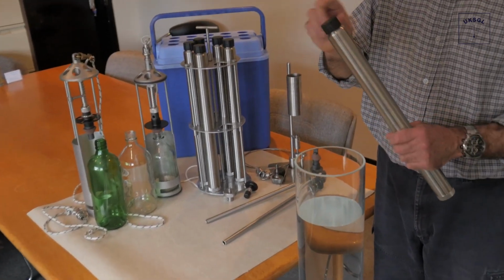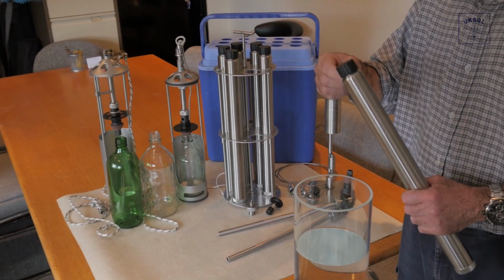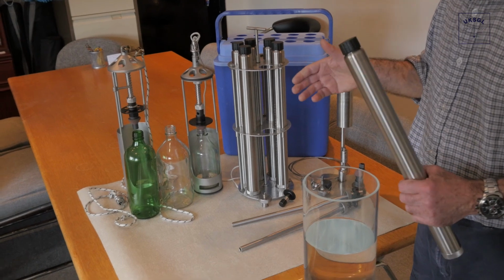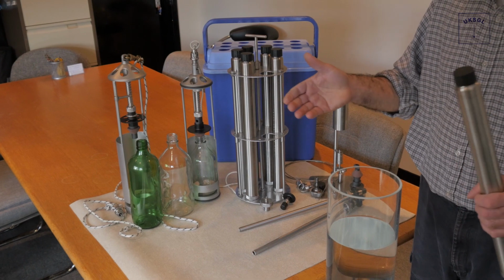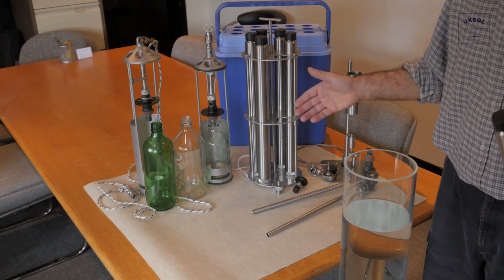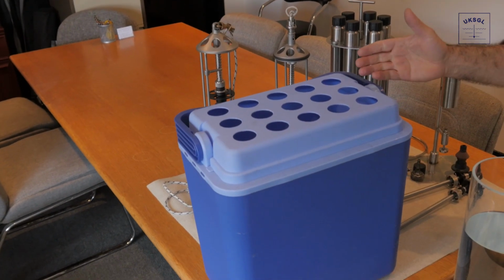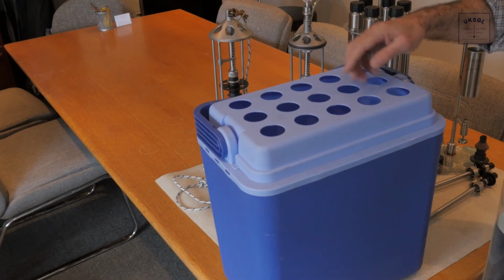It's good practice to mark each sample tube with a label to show which tank the sample is from. There should be 1 sample tube per tank, so you should ensure you hold enough tubes in stock. In addition, you may need to take 1 or 2 spot samples, so an allowance must be made for extra sample tubes. In the time between the samples being taken and being delivered to the lab, the samples should be kept cool as per ASTM D323.